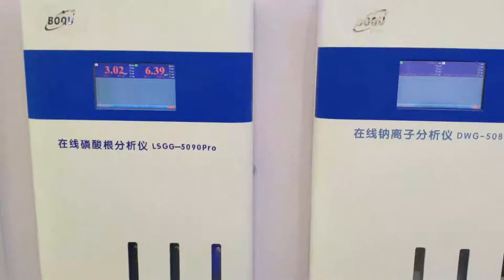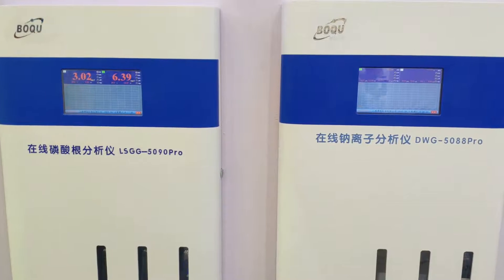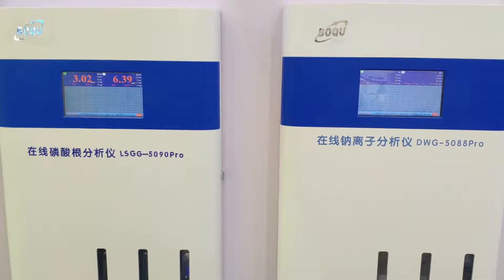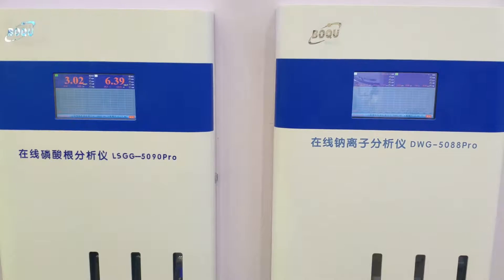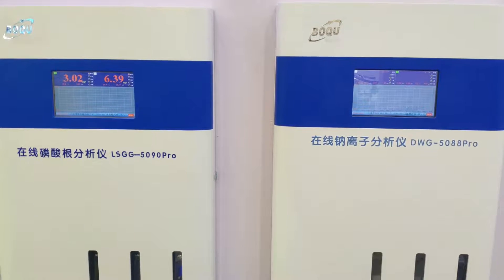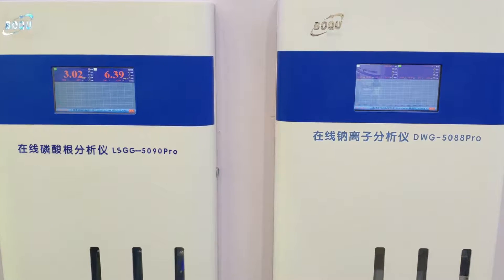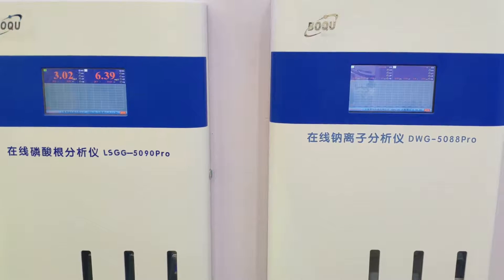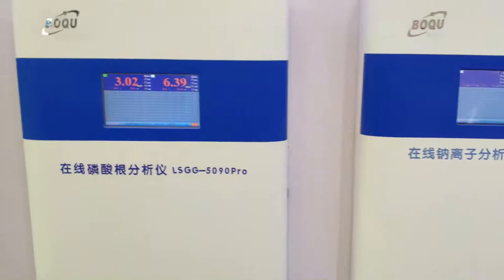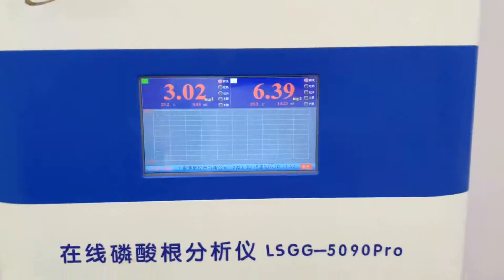Here is our lean bottle — a phosphorous, sodium, and silica analyzer with special use for power plants in the SWAS system. The SWAS system is a steam sampler system in a power plant, and it can be configured with six channels.